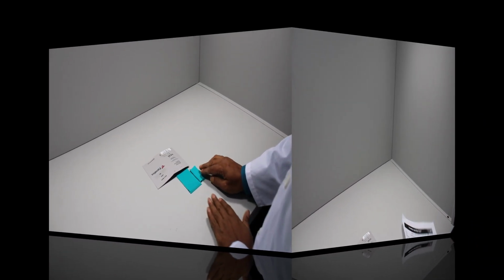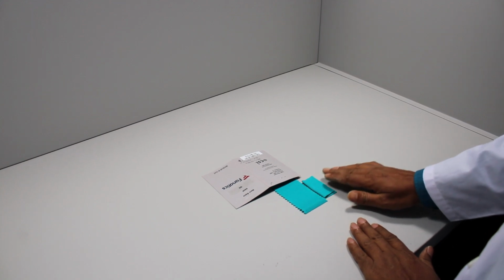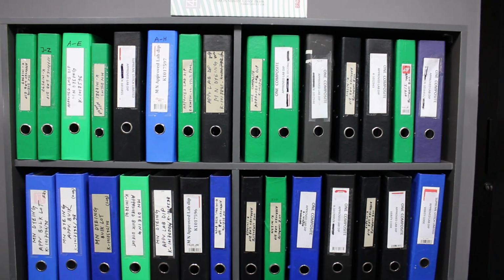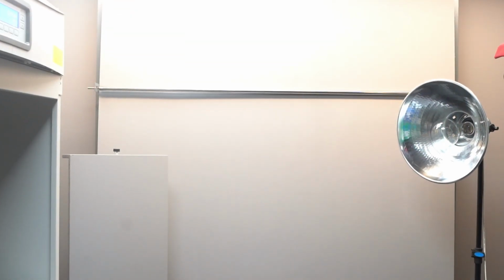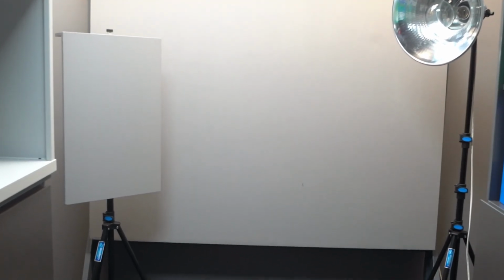The spectrophotometer works by passing a light beam through a sample to measure the light intensity of the sample. These instruments are used in the process of measuring color and for monitoring color accuracy throughout production. The AATCC viewing board is used to assess the smoothness of flat fabrics and seams, specifically retention of creases.